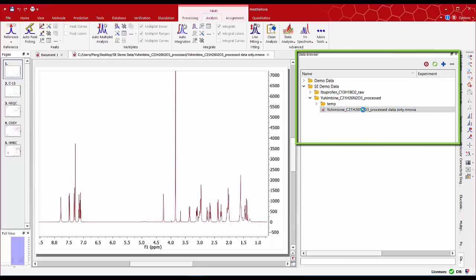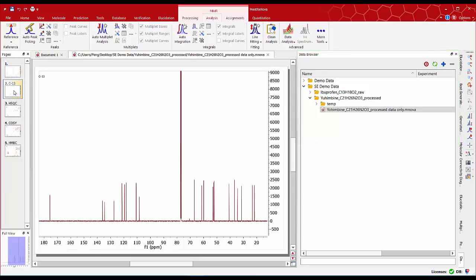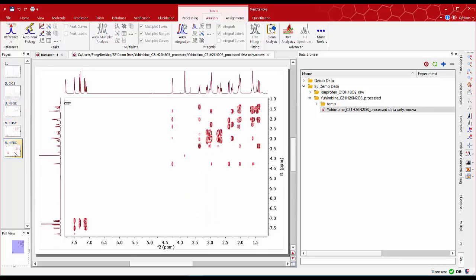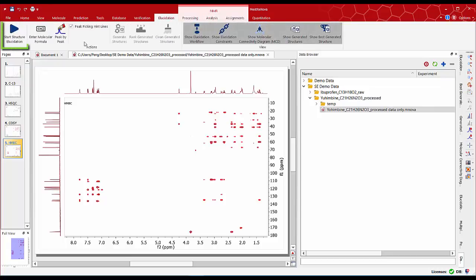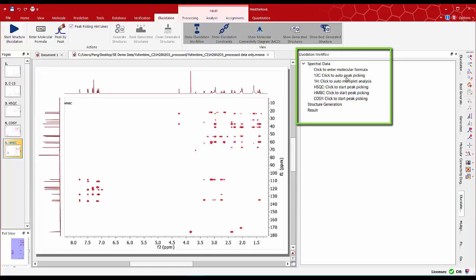Double-click on the MNOVA document in the data browser. We get 1D proton and carbon spectra HSQC as well as COSY and HMBC 2D spectra. Click on the start structure elucidation button and follow the instructions displayed on the elucidation data panel to guide the spectral analysis in the structure generation.